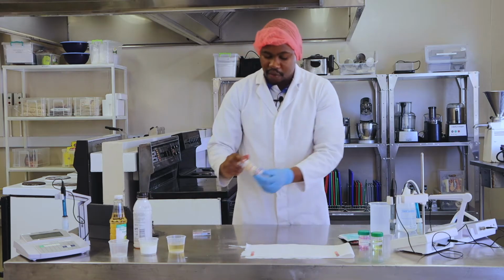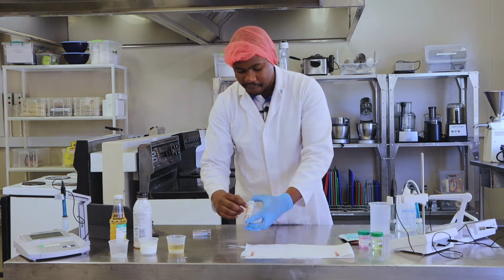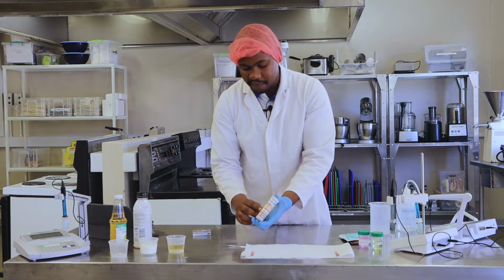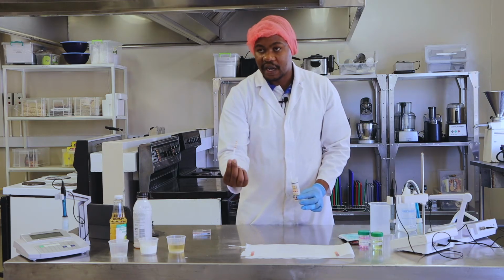You can also use these types of color strips, which on top have a number from 0 up until 7, and then from 7 up until 14. These strips have 4 different color codes.